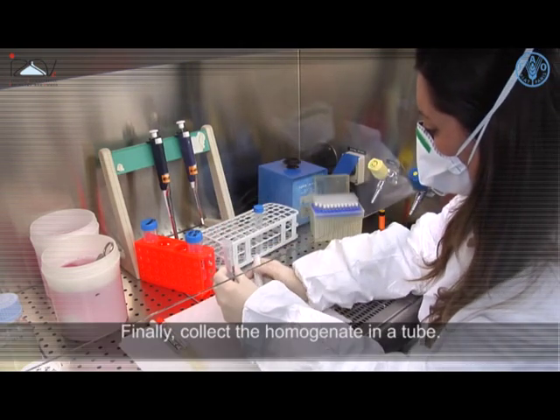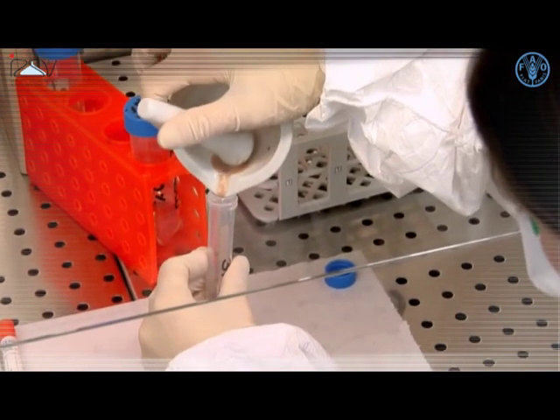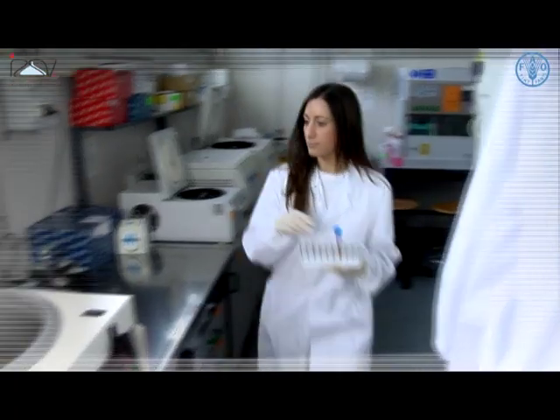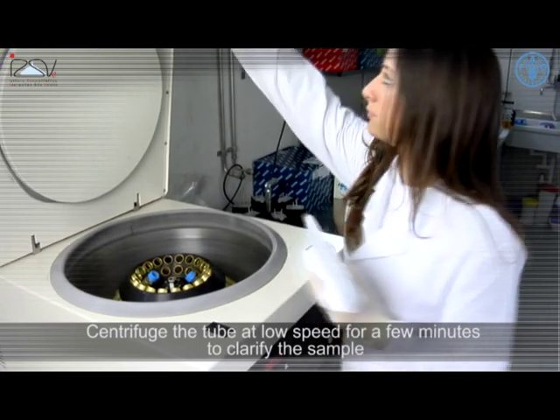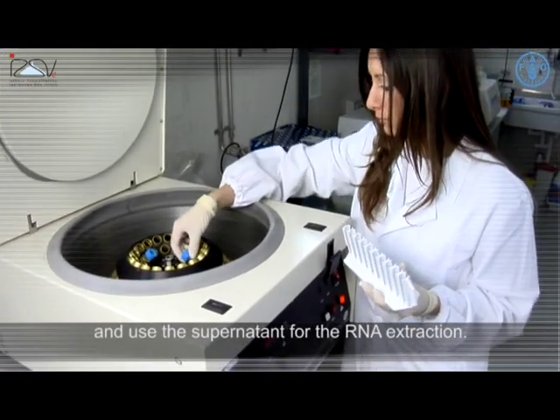Finally, collect the homogenate in a tube. Centrifuge the tube at low speed for a few minutes to clarify the sample, and use the supernatant for the RNA extraction.